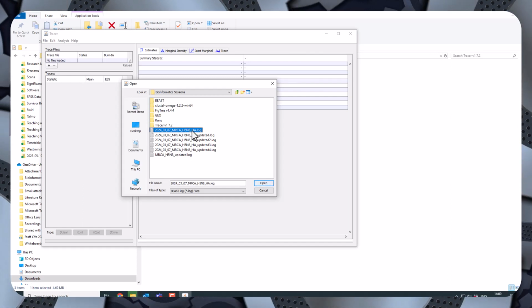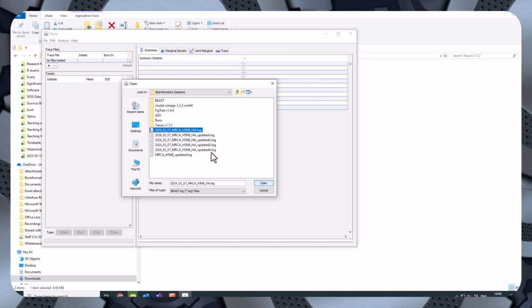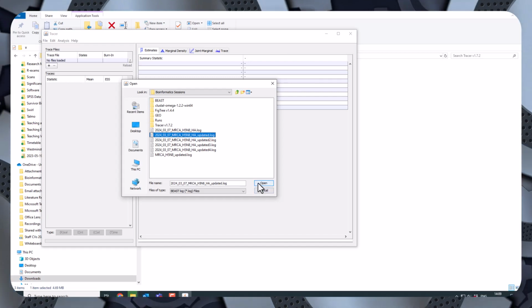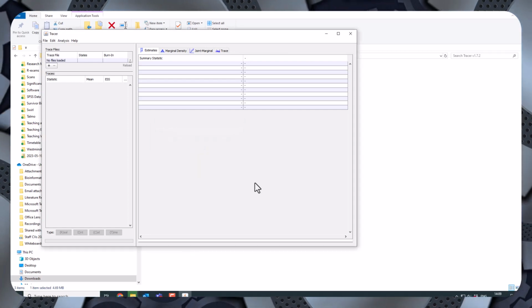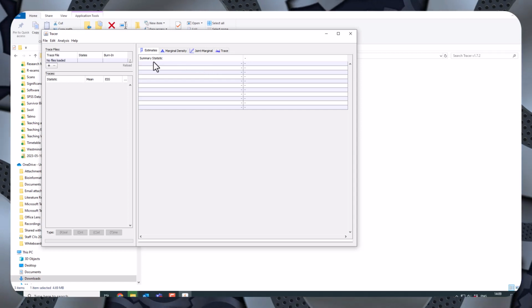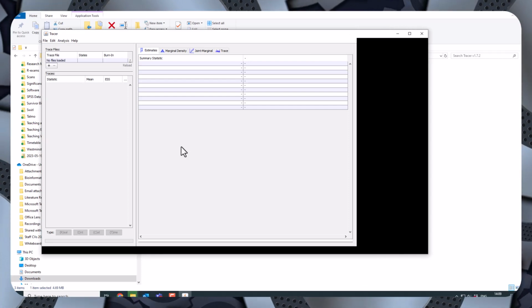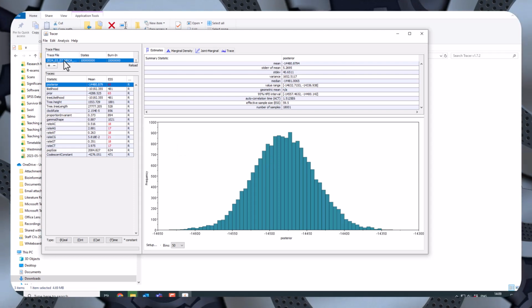When you open up the trace file, it starts in this column labelled the posterior. This is posterior probability. You don't have to particularly worry about it. So the most recent common ancestor is the height of the tree. What I want to do is click on the thing that says height of the tree, and it gives me this. It says that the mean is 1553, the median is 1546.